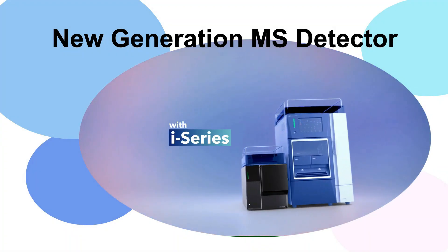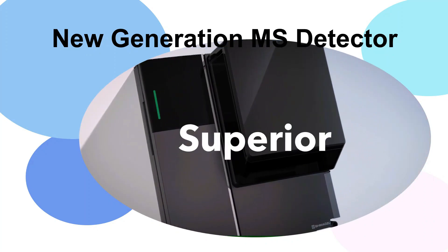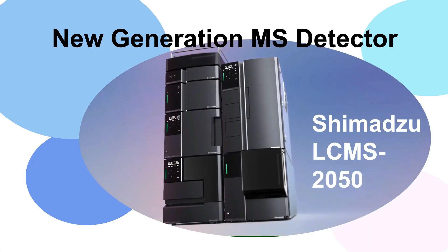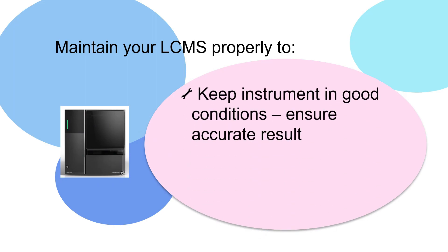Designed to be used and maintained easily by users, this is Shimazu's new single quadrupole mass spectrometer, LC-MS 2050. Maintenance of LC-MS is very important to ensure that the instrument is always in good condition and hence producing accurate results consistently.